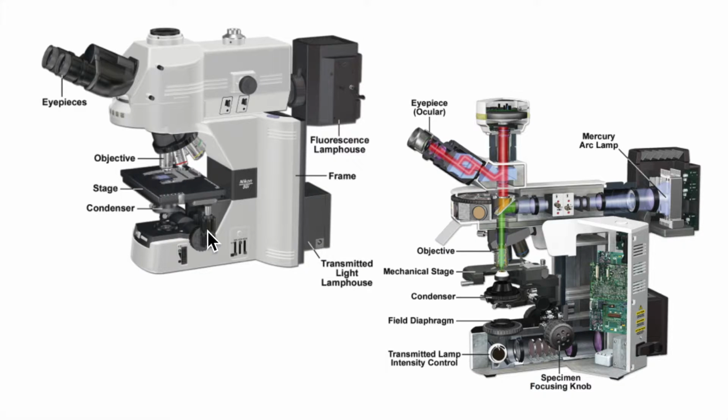And then we also have the stage, which allows us to position the specimen in the X and Y direction, but also the Z direction. So we can move on the specimen surface, but also move the specimen in the optical axis into the right position for focusing.